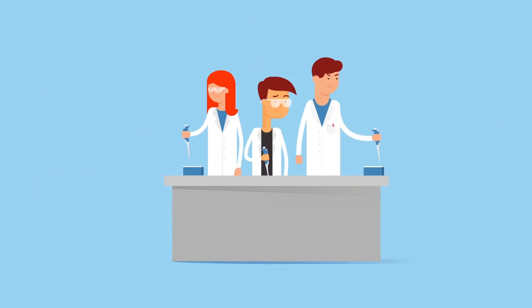In Linda's lab, her colleagues spend a lot of time with their pipettes. It's not a task everyone enjoys.